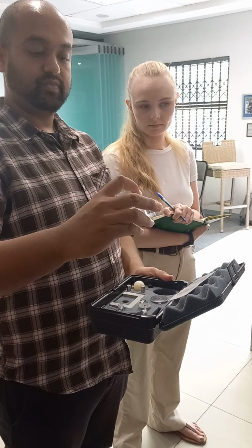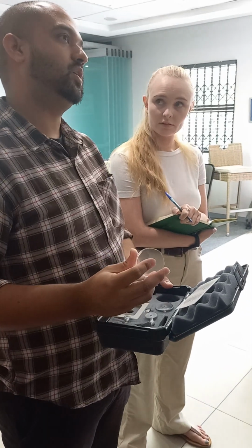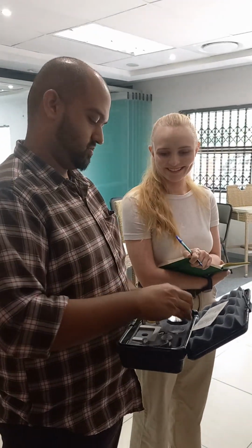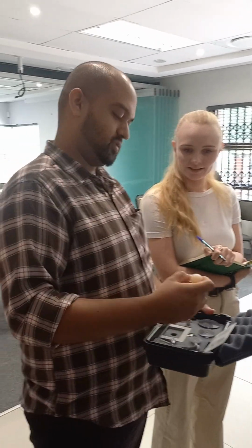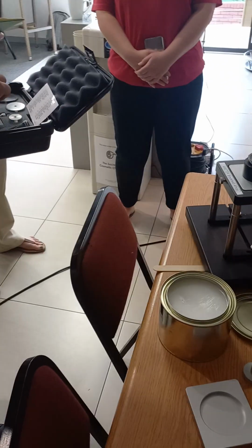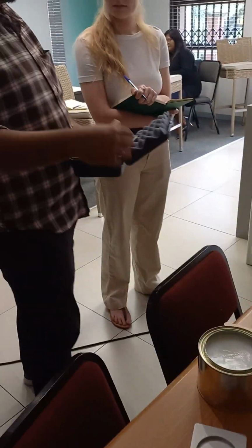We have a lot of these flat discs that would apply specific pressure to a sample. This is more for samples that have a high elasticity. Things like a stress ball, you squeeze it and it must return to its original volume. This would be a good test for that, to ascertain how soft or hard your stress ball is. This fixture, for instance, likens the pressure of your thumb on something. So we can possibly use this on some of this PJ to determine how much force you need to disrupt it with your thumb, like trying to pull some out with your thumb.